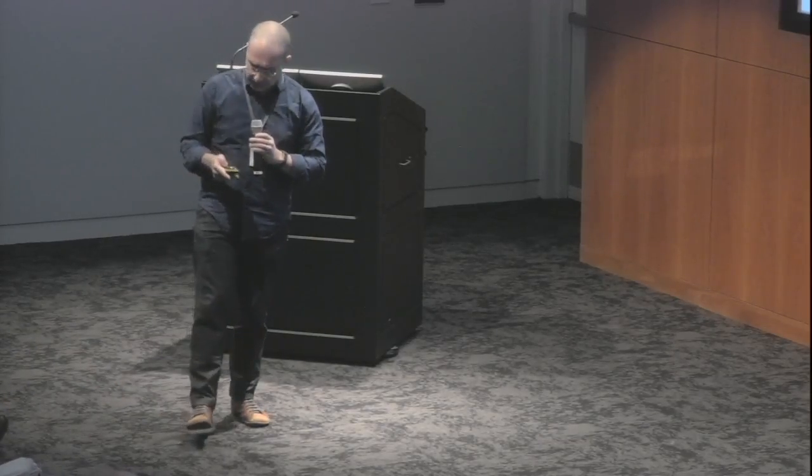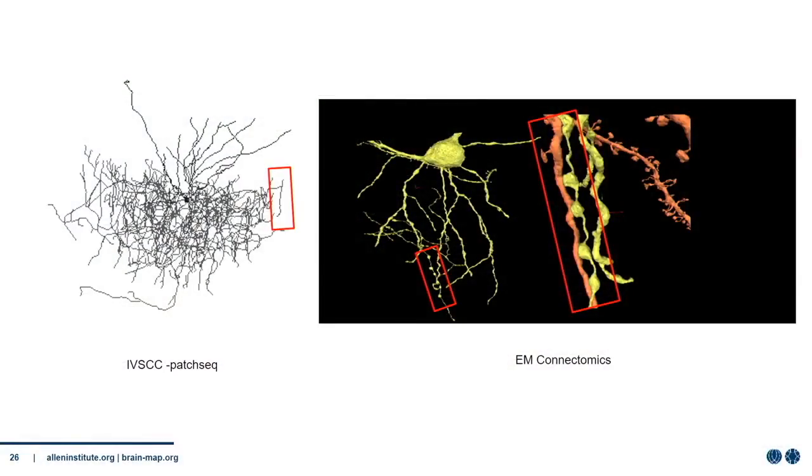And one thing that we are interested in this smaller data set before we get the larger one is the interaction between inhibition and excitation. And I'll show you an example from a cell, which is a Chandelier cell. You see here an example of their more complete arbor coming from our patch-seq pipeline. And like basket cells, this is the type of cell that controls the output of a neuron. And what's interesting about it, and it's very specific, is that it's called Chandelier because it has these branches that are called candlesticks or cartridges. And in these cartridges, this cell innervates the initial part of the segment of axons.